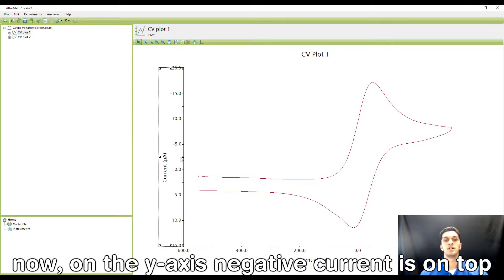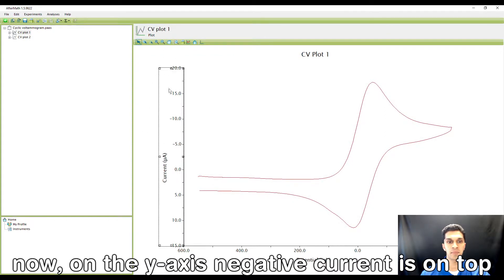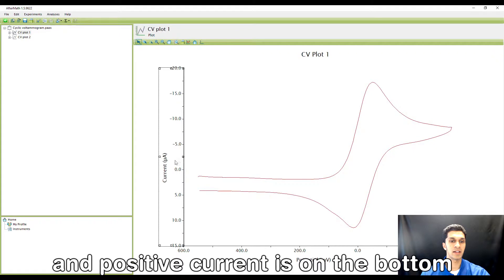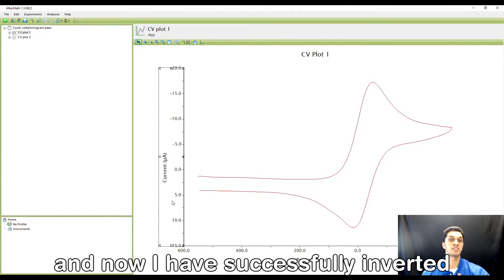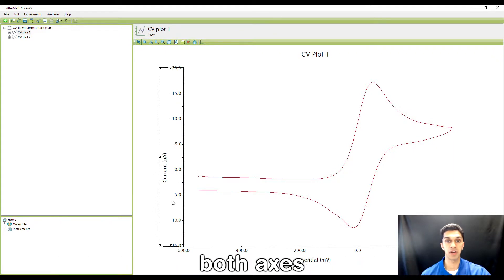Now on the y-axis, negative current is on top and positive current is on the bottom. And now I have successfully inverted both axes.